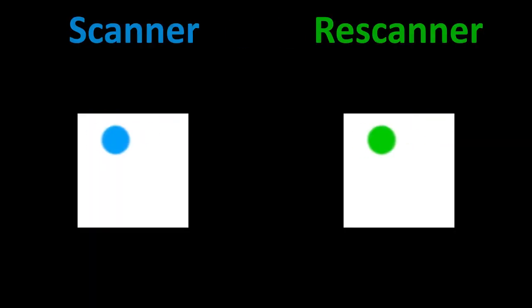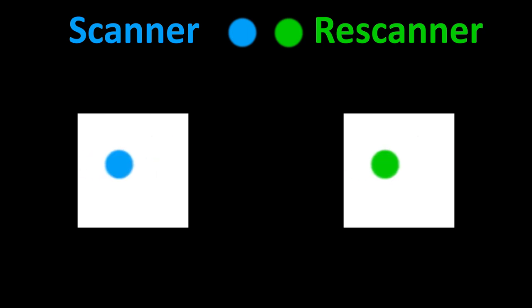Now let's examine the way RCM improves the resolution. Here you see a schematic representation of the principle. On the left, the blue laser spot is scanning through the sample. On the right-hand side, the emission spot as it is written on the camera chip by the rescanner. Here the sweep of the scanner and rescanner are identical, and we obtain the standard diffraction-limited resolution.